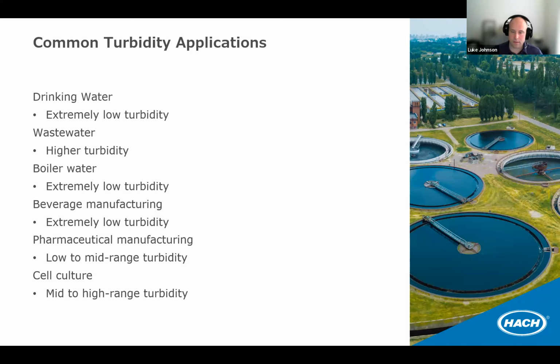And we in the United States have spent a lot of time treating our drinking water, getting better at it every year. And at some point we started chlorinating our drinking water to kill all of the bacteria and viruses in there. But some things are not susceptible to being deactivated by chlorine, specifically cryptosporidium and giardia. The spores and the cysts of these microorganisms can make it through chlorination treatment. So the way that we remove those is through filtration, and the way that we test to see that we've removed those is through turbidity.